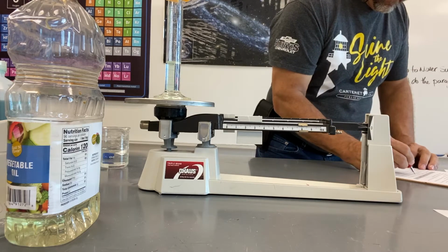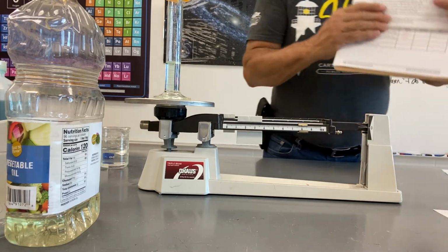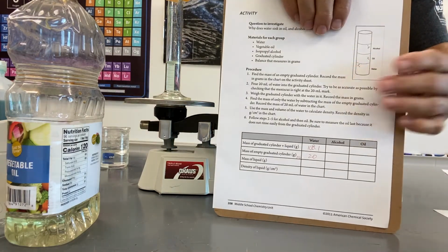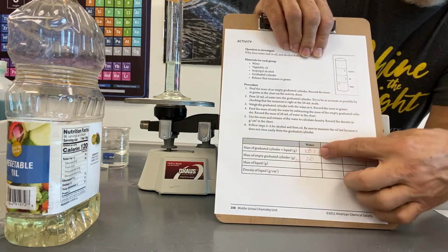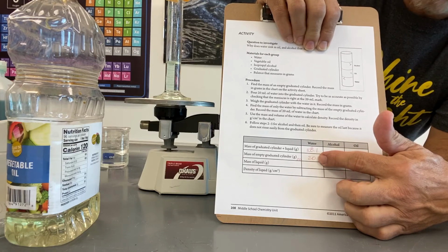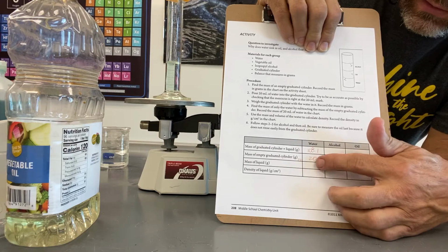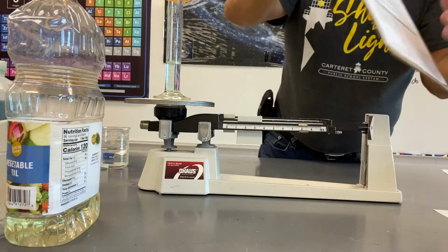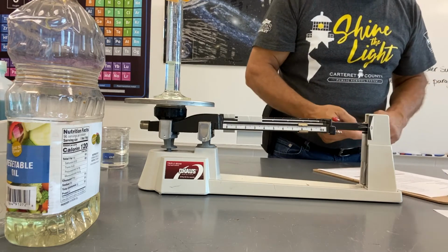So we'll show you the first one here as I'm working it with you. So I've got at the top here, this is what my graduated cylinder with the liquid in it weighs. This is how much we got from weighing the graduated cylinder empty. Now we're going to be subtracting to find out what the mass of the liquid is, because we want to take away the weight of the cylinder, right? We don't want to be adding that in.